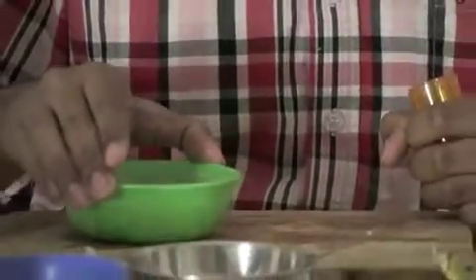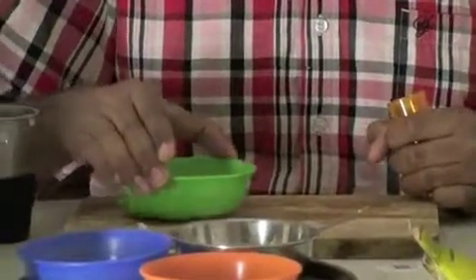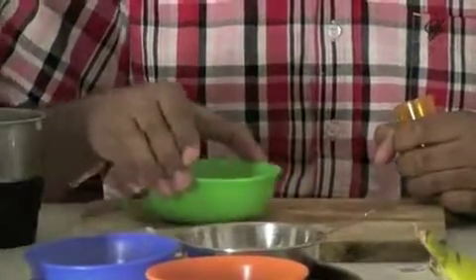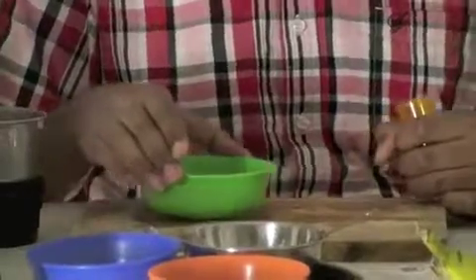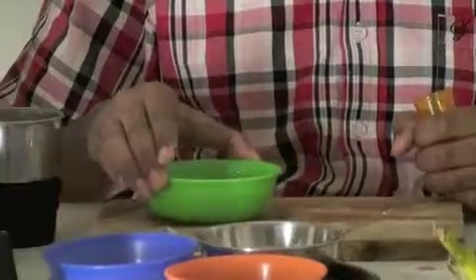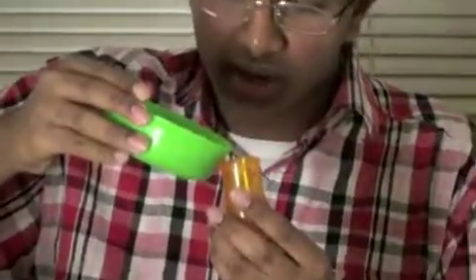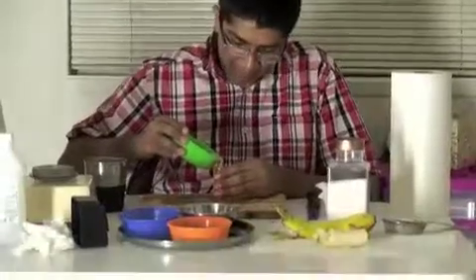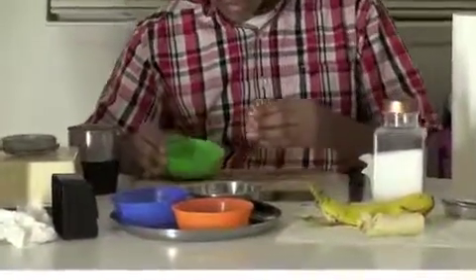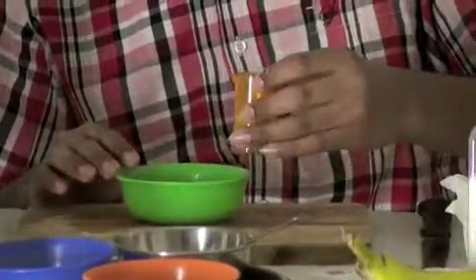Now what we do, pour the mixture. The enzymes, by the way, what they do, they get rid of all the proteins. They don't really get rid of them, they cut them up. Because at the center of the cell is the nuclear membrane, and that's where all the DNA is stored. So, now we're going to pour it into this medicine bottle. Not all of it is necessary. And I'll probably be a klutz and pour half of it down on the ground. So we don't need all of this. We can pour a little bit out.